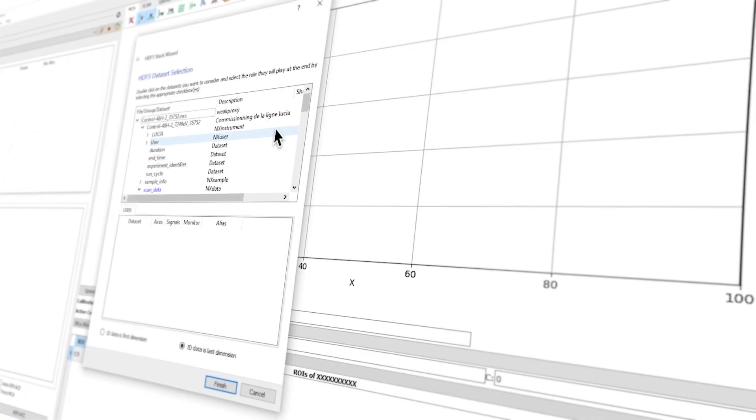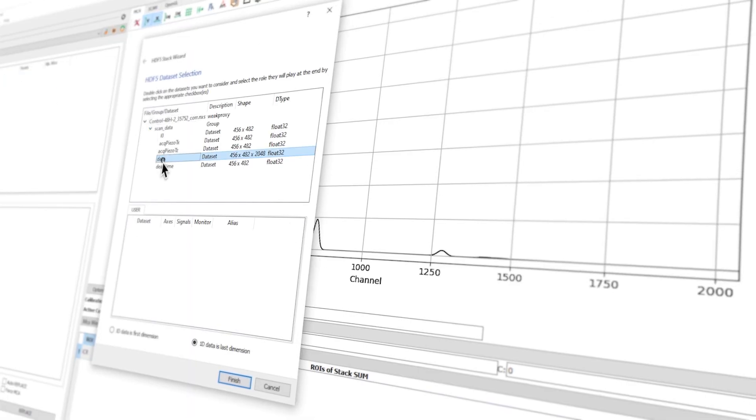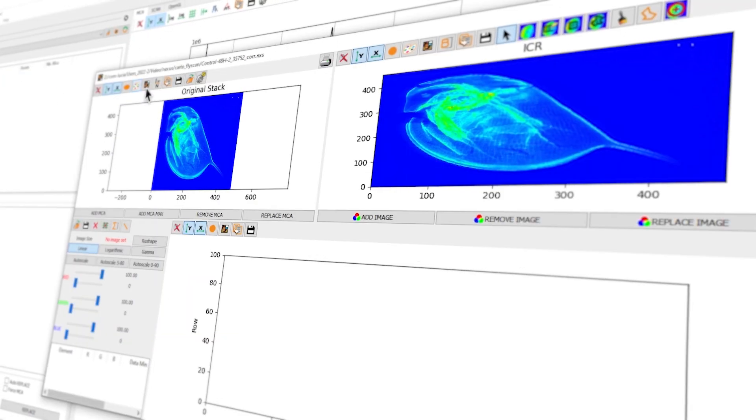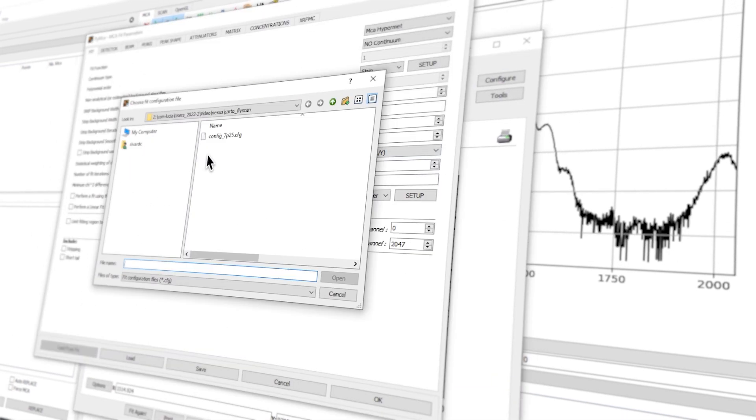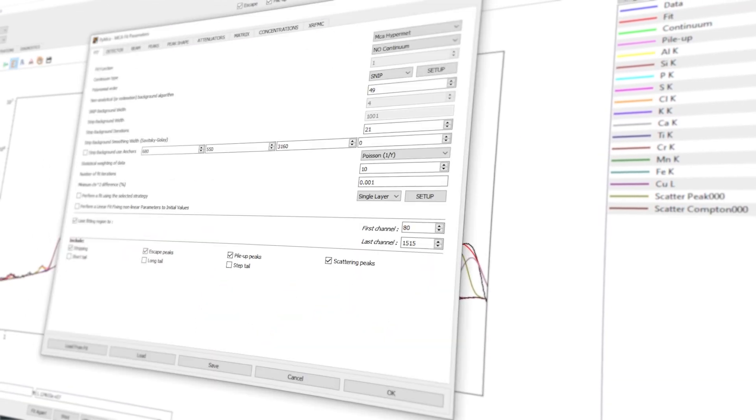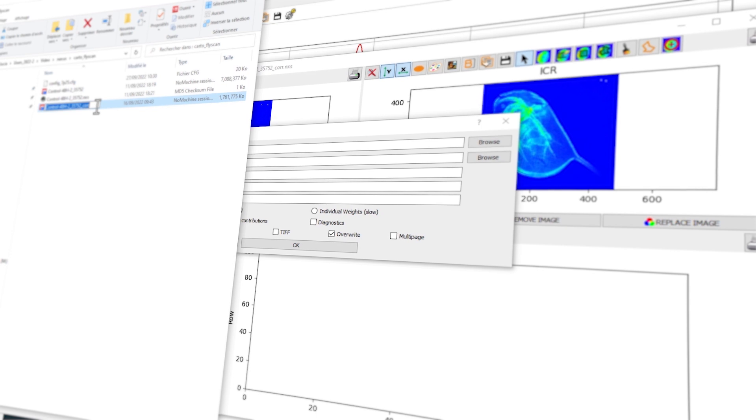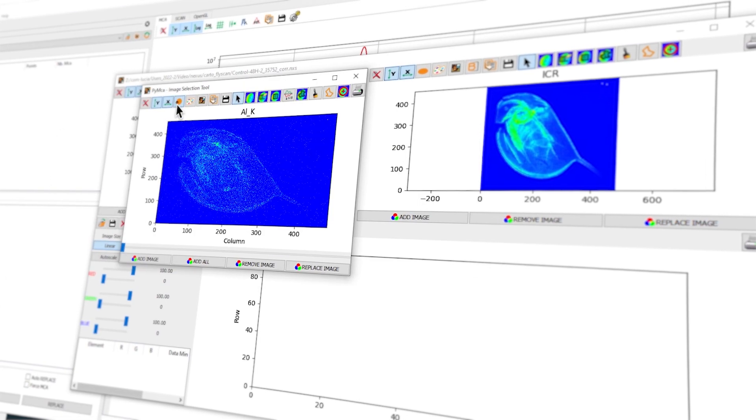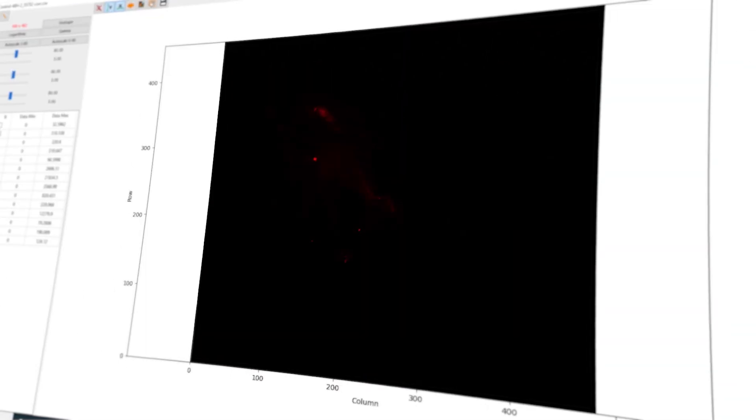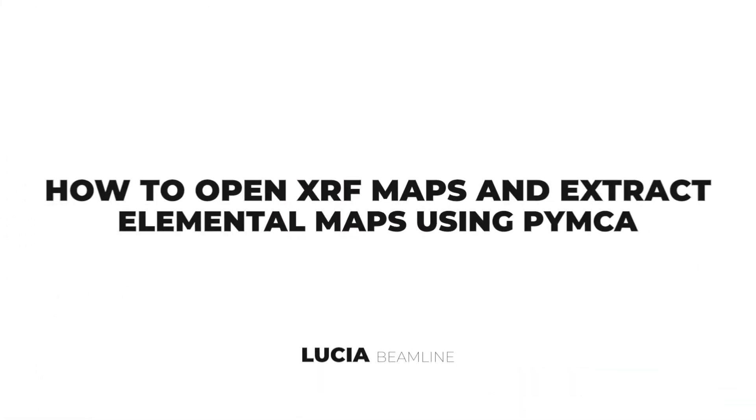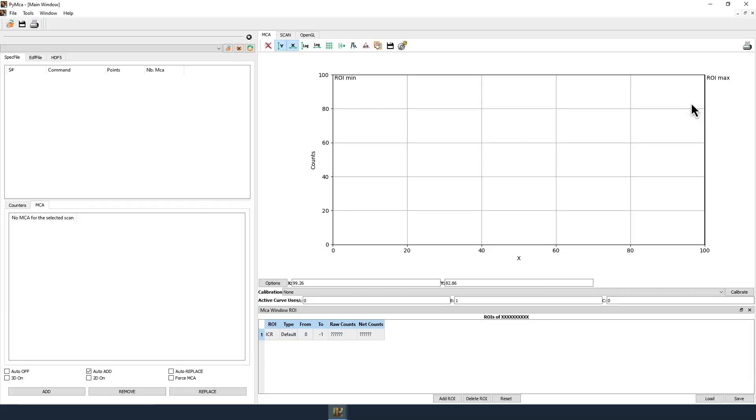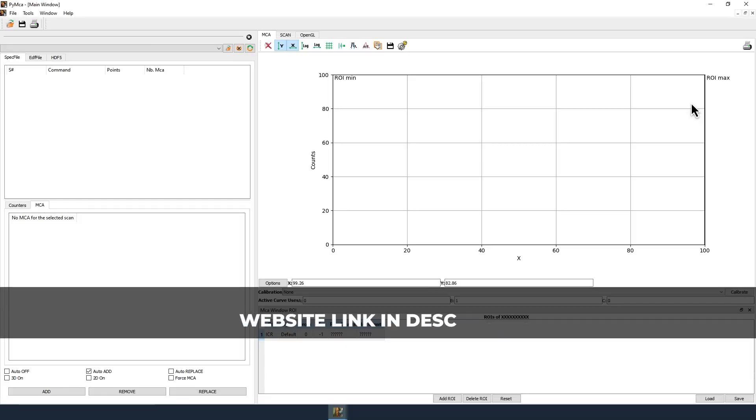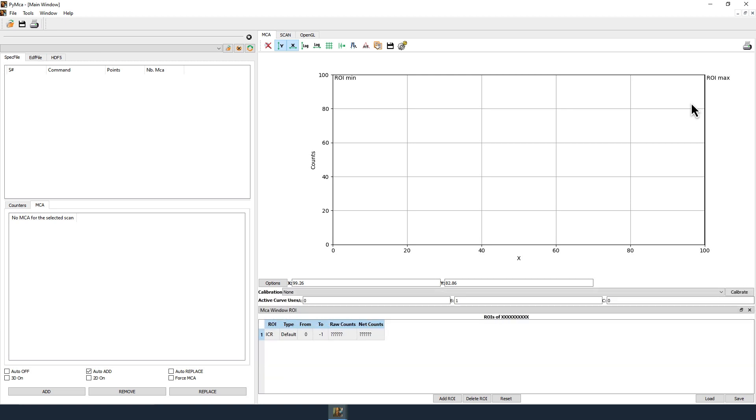This video shows how to open the Lucia beamline X-ray fluorescence imaging data and extract elemental maps by fitting the X-ray fluorescence spectra in each pixel using the Pi MCA software. Pi MCA has been developed by the software group of the European Synchrotron Radiation Facility and can be downloaded for free on its SourceForge page.